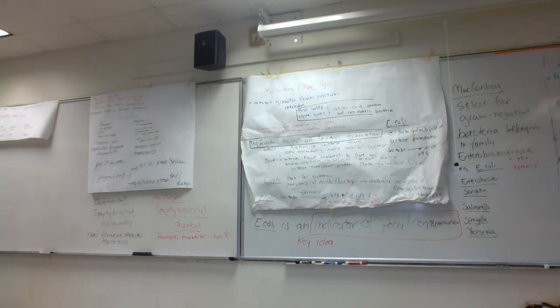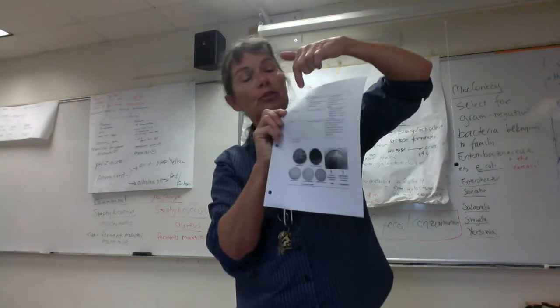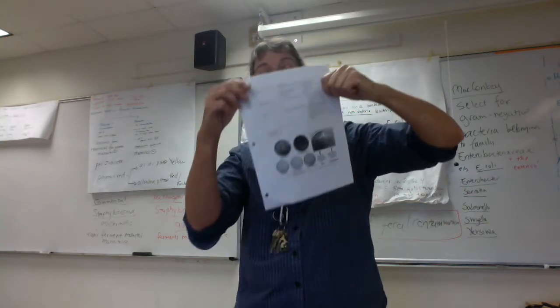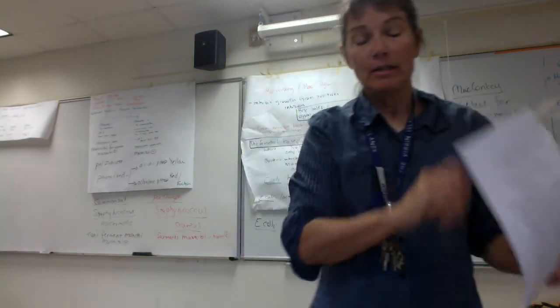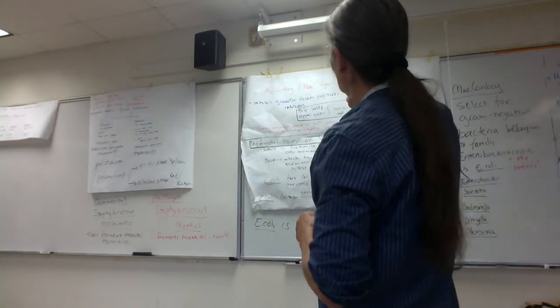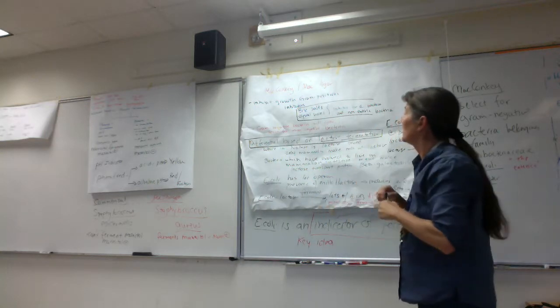So you guys, MacConkey's then, if we turn to page 3, okay, and up at the top, you guys, it should read differential media. The title got cut off on the previous page. So if you put differential media up here, right? So MacConkey's media, folks, is differential based on the ability to ferment lactose. So here's our MacConkey's here. It's differential based on lactose fermentation. Okay.